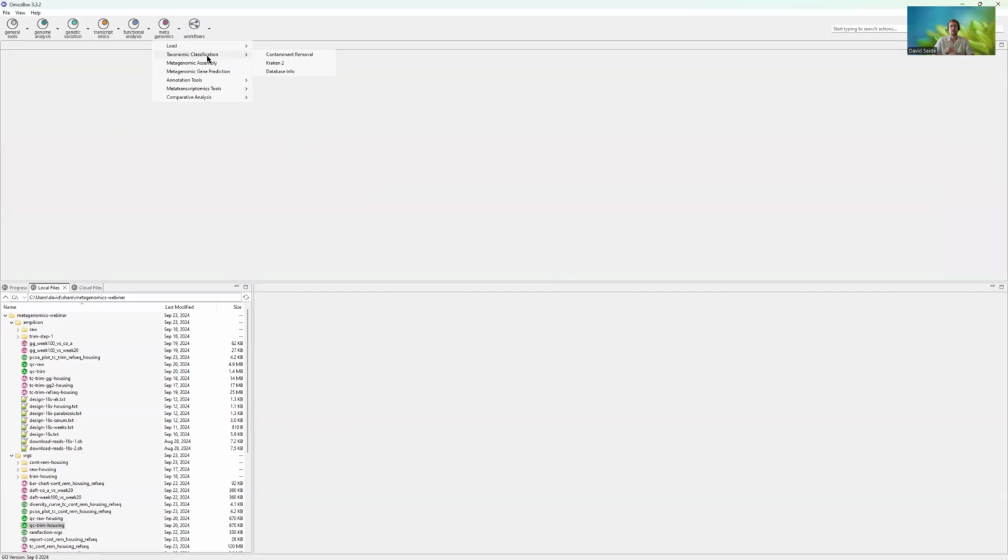We don't have mouse in our target database for the taxonomic classification, so we will get reads that will be unclassified or falsely assigned to maybe bacteria, and we don't want that. We want to remove that noise, so let's get rid of those, and this is called contaminant removal.